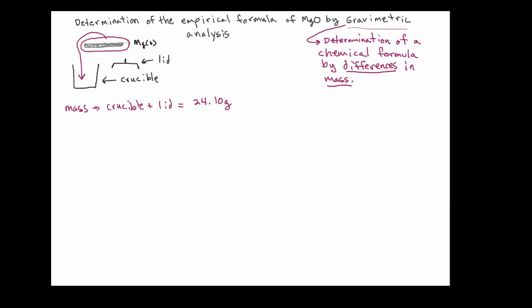But we'll add the magnesium to the crucible and then we're going to mass again, only this time we're going to have the mass of the crucible, the lid and the magnesium metal together. This is where this idea of differences in mass comes into play. So now my new mass with all three items is 24.23 grams.